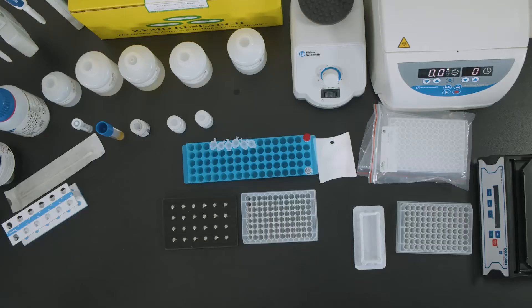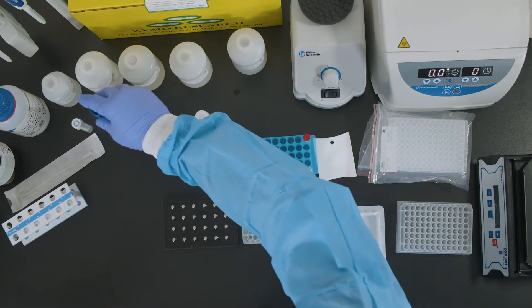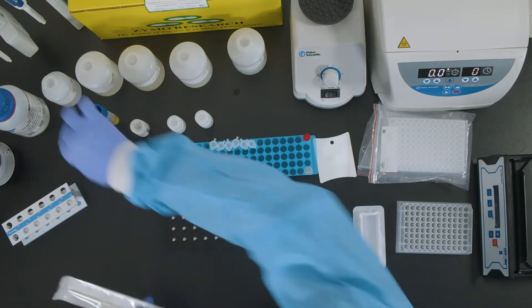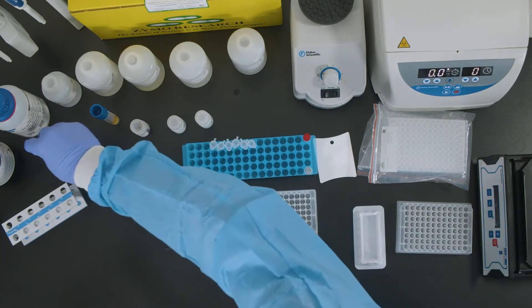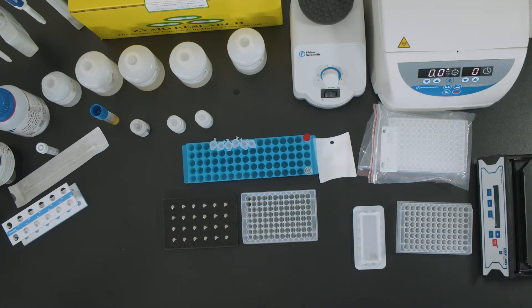If you have not already prepared the kit reagents, do so now. Here we have prepared the reagents and are ready to start. Clinical or environmental samples may be used with this process. In today's video, we will show you the general approach to nucleic acid extraction from any of these samples. The protocol for each sample type may be found in the PathogenDx product insert.